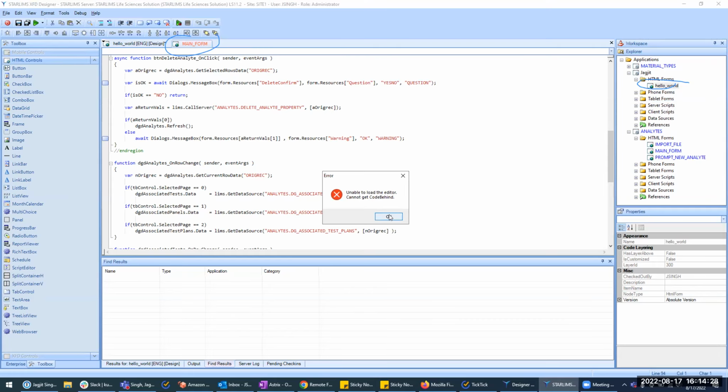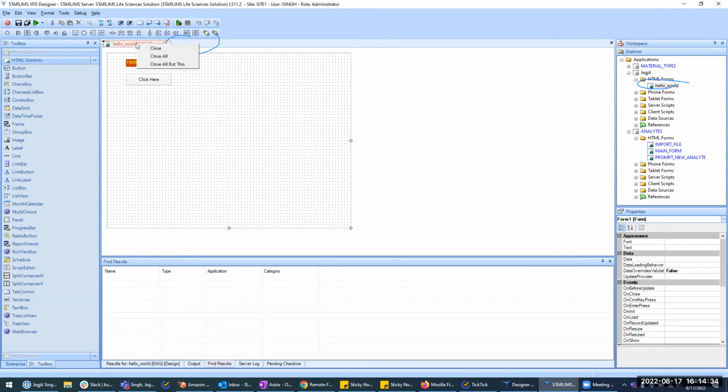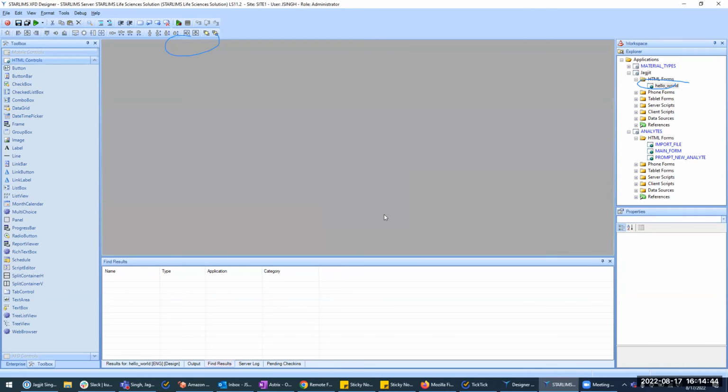Oh wow, we're completely, all right, so close everything out. I don't know what happened here. Close all. I hope we don't lose all of our little form. Save it, see if it lets you. What happened? All right, just close it. Okay. Double click on it to open it.